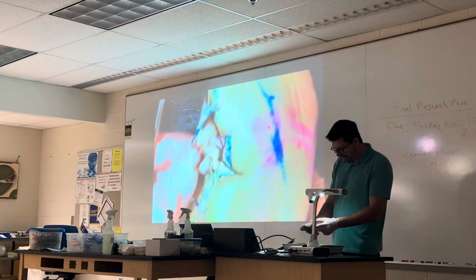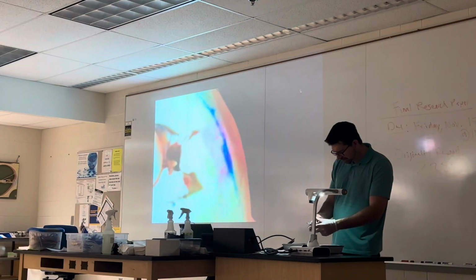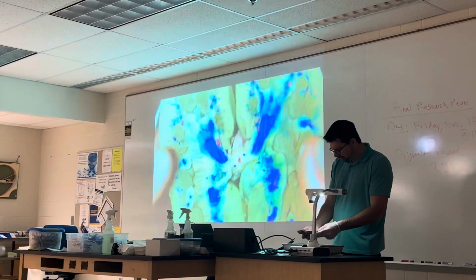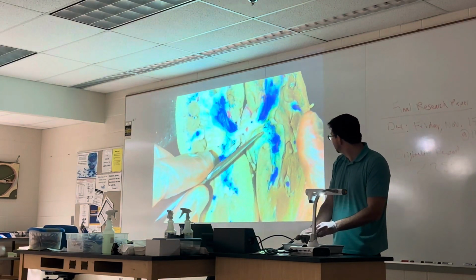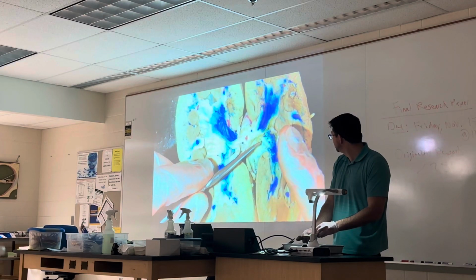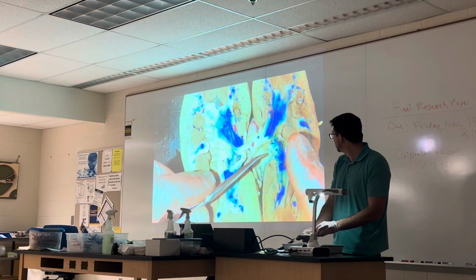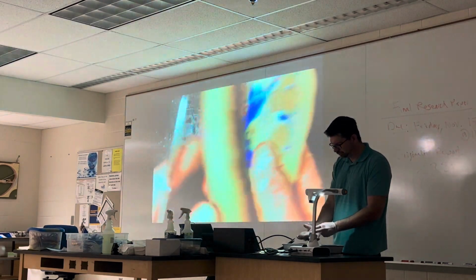And then for the renal vein, it's not looking real promising for that, is it? Ah, here it is, okay. So right here, this isn't the best, but this is where the renal vein would be. It looks like they severed quite a bit off, but the renal vein would be situated about right here.